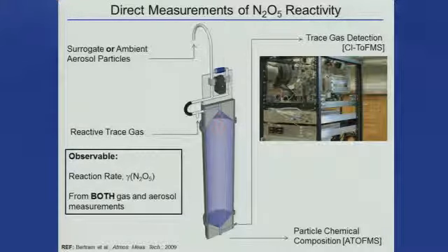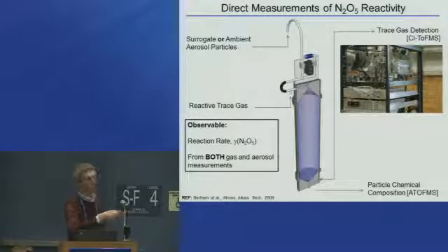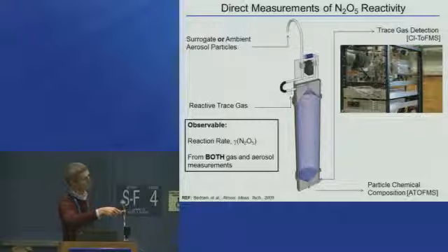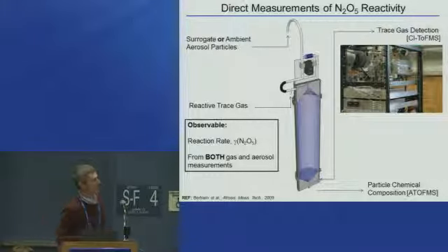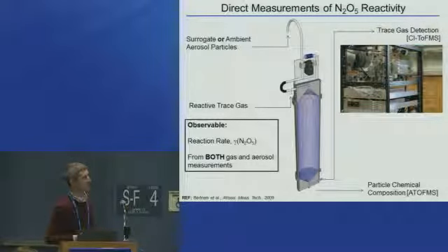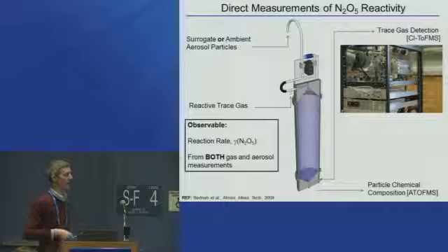What we do is we take ambient aerosol particles and we bring those into a large-scale flow reactor. So we're basically bringing in the ambient particles, and we're entraining into that system a wide number of reactive trace gases, so whatever your choice is. In this case, it's N2O5. We add that into the system, and we basically allow them to steep in N2O5. Now steep, I mean, is sort of a slight word because we're not trying to change the chemical composition that much. We're basically trying to probe that rate. So we only add a small amount of N2O5 to the system. We add in about a part per billion or so when these experiments are done in their optimal sense. And that allows us not to build up or basically change the chemical composition of the particles extensively during the course of this reaction, but just probe that initial uptake rate.